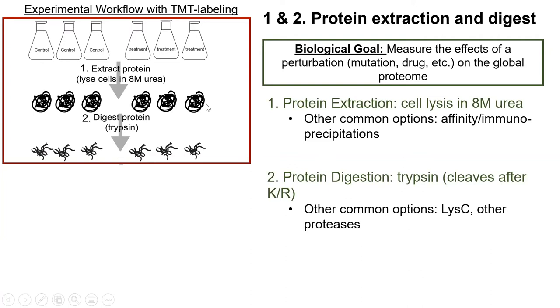I think Dr. Dowd mentioned using trypsin in her lecture. Trypsin is the standard used in the field, and it cleaves after lysines and arginines. Another common protease that can be used is LysC. You might gather from the name, it cleaves after lysines. And there are other proteases that are options.